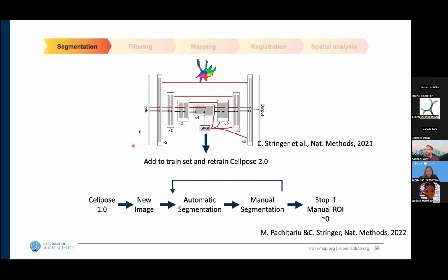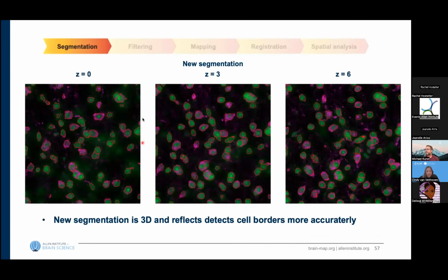And just to look at this, so here's an example, and I think you can already immediately appreciate the difference in the cell segmentation quality here. It's really good at detecting cells in very dense areas. It also much more stays around the actual cell outline. And you can actually see how cells change in size if you go through the different Z planes. So this one here changes.